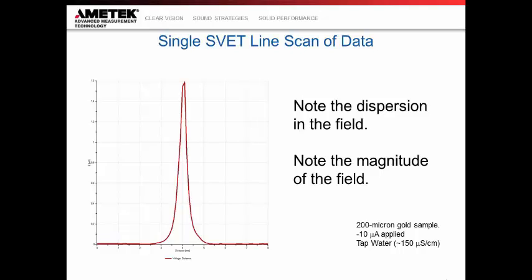It's important because we could use an optical microscope to visualize the size of that pit. But what you could not do, and what you need a localized electrochemical technique to do, is to image the intensity of the pit. Maybe the pit's very large but not intense and passivated. Maybe it's very small but very intense. So this tells us that a single pit will visualize, maybe in this particular example, 10 times larger than it is itself.